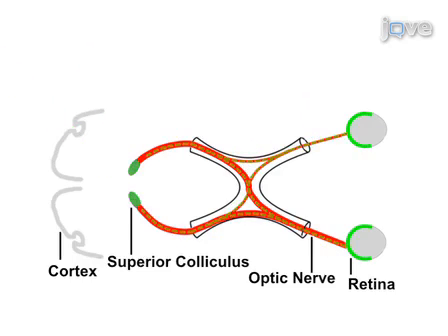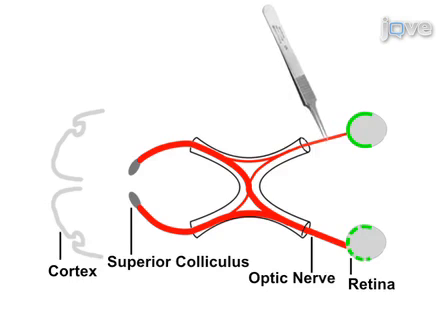As a second step, an optic nerve crush injury is made on day four to cause optic nerve degeneration, which will lead to a gradual death of the retinal ganglion cells. On day 11, the retina is dissected in order to investigate retinal ganglion cell survival.